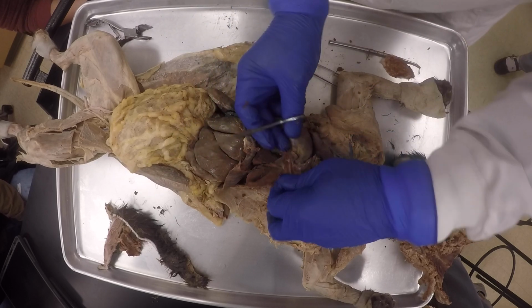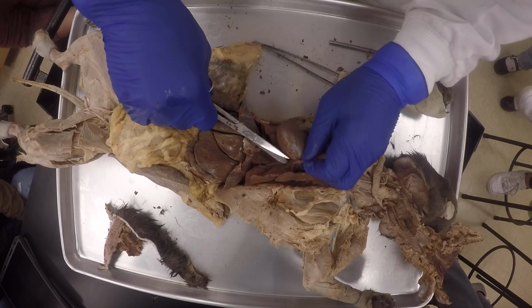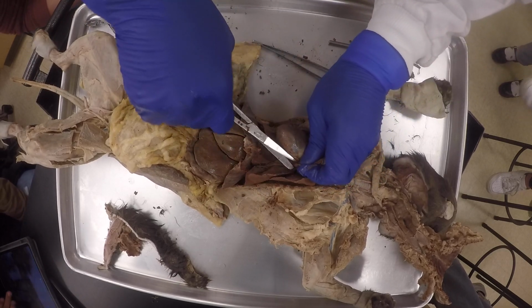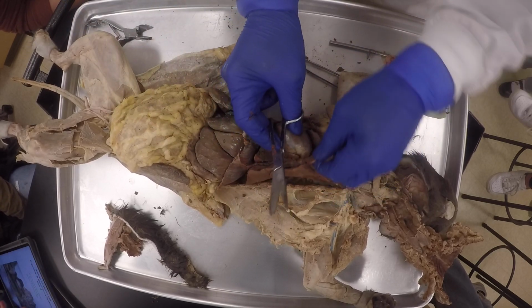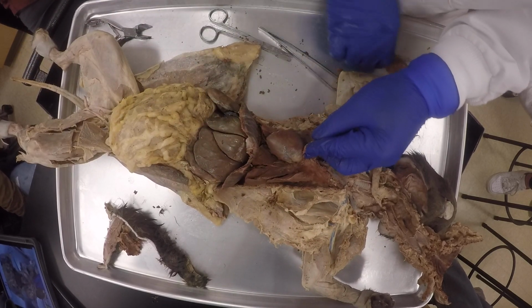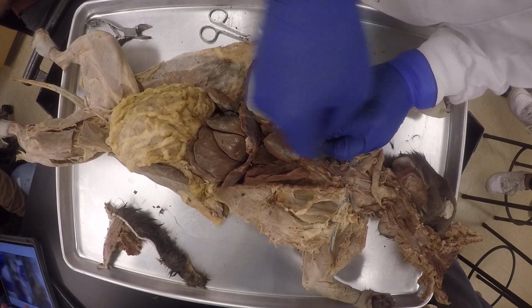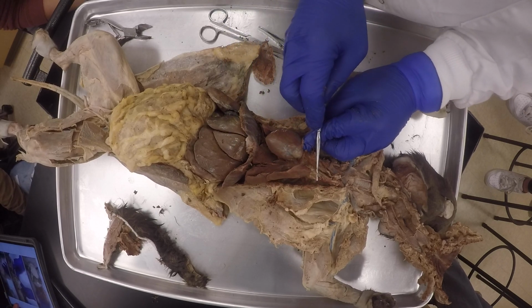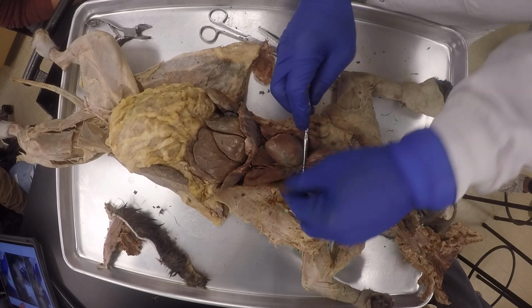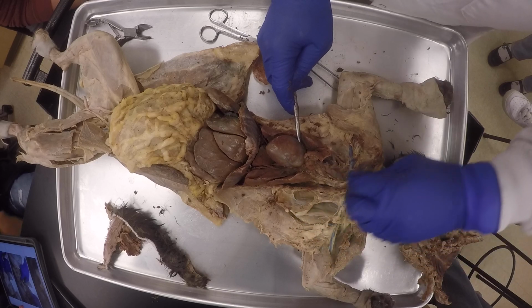You see what I'm saying, my good friends? Looky here. Isn't that cool? I'm removing the fibrous pericardium, the one on the outside, and then I'm going to be exposing. So we want to hook this. You see my nerves? There's the phrenic on the other side. You see it's going down there.